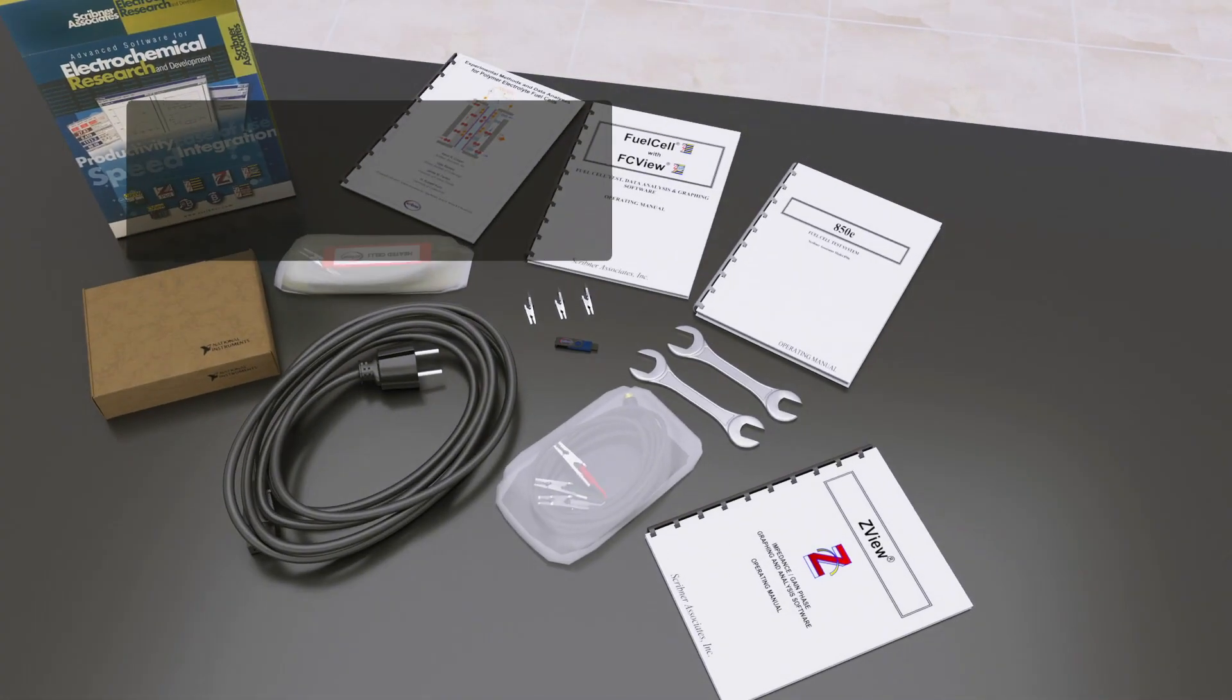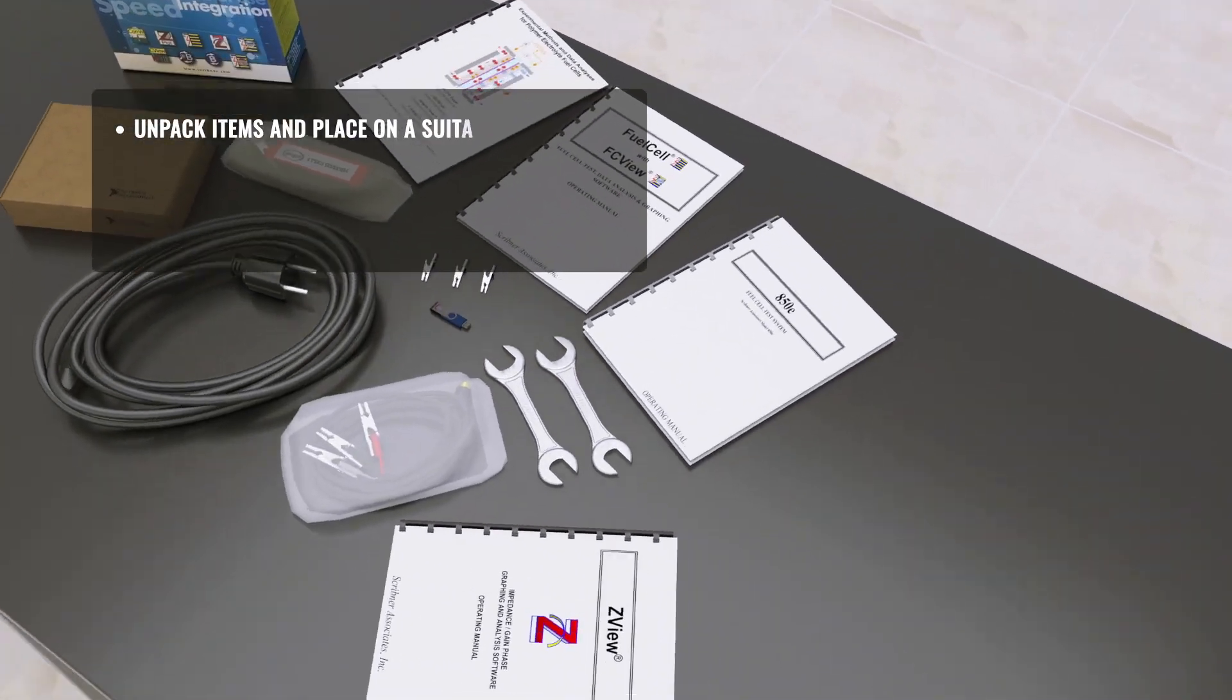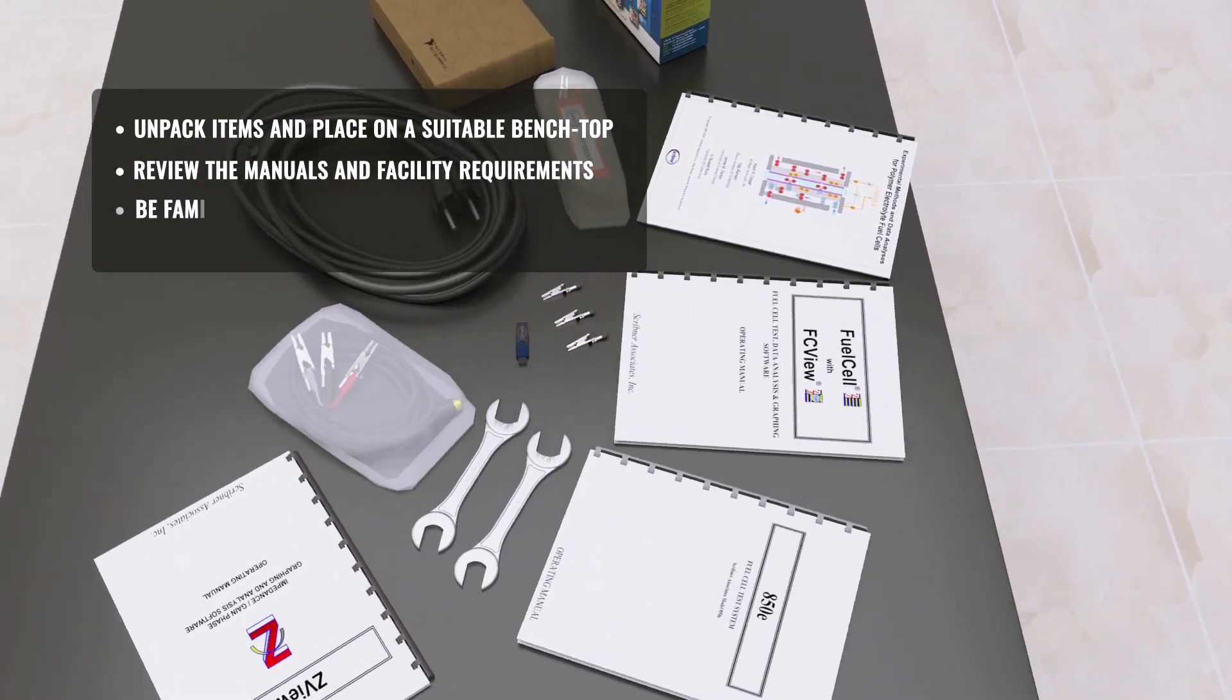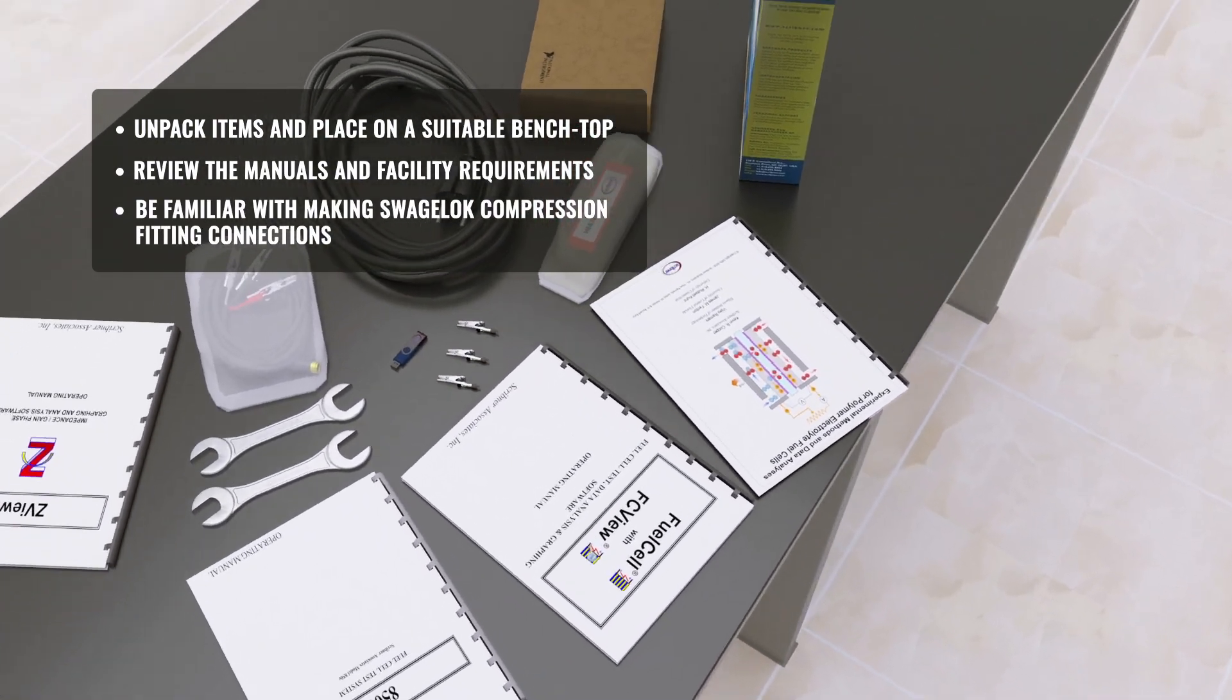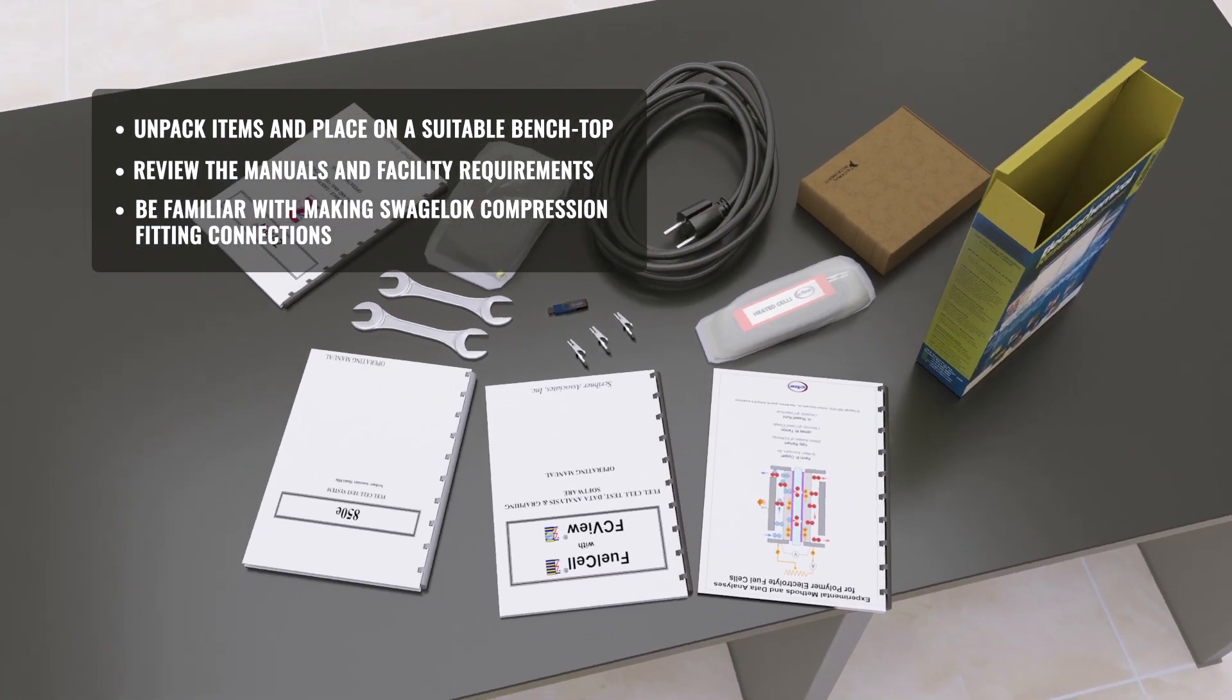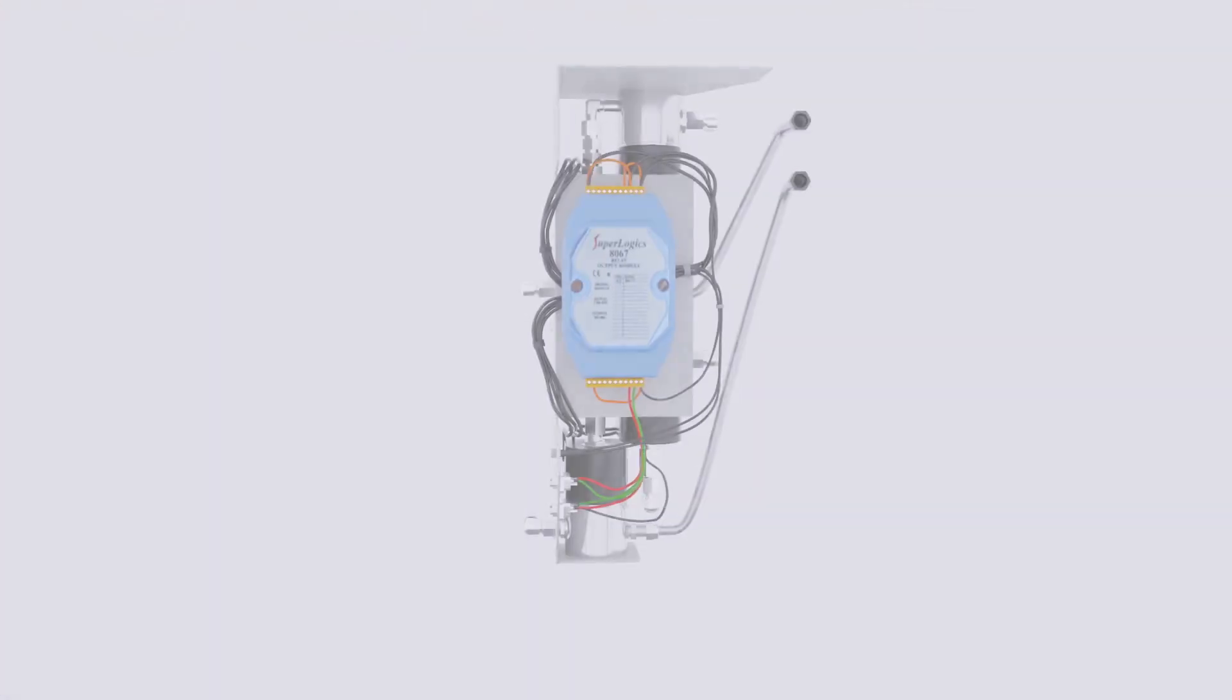Scribner Associates 850 Fuel Cell Test System is a compact, turnkey instrument for fuel cell research and development. Simply follow the instructions to complete the installation process and get started testing.